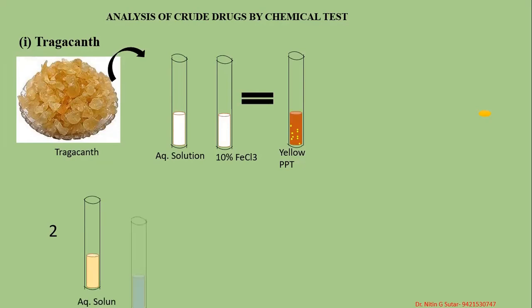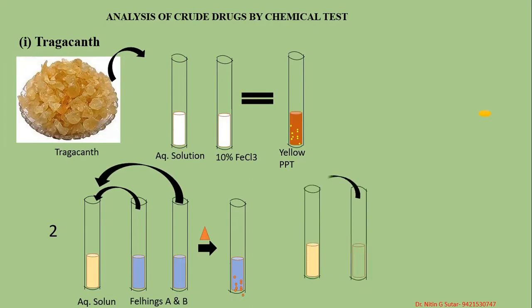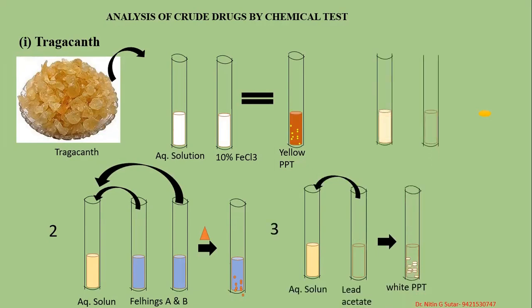The second test: take the aqueous solution of tragacanth, add Fehling's solution A and B, and heat that particular mixture. A reddish-brown color precipitate is formed. This is the second test. The third test: to the aqueous solution of tragacanth, add lead acetate. White color precipitates are formed. I will show you that white color precipitate.